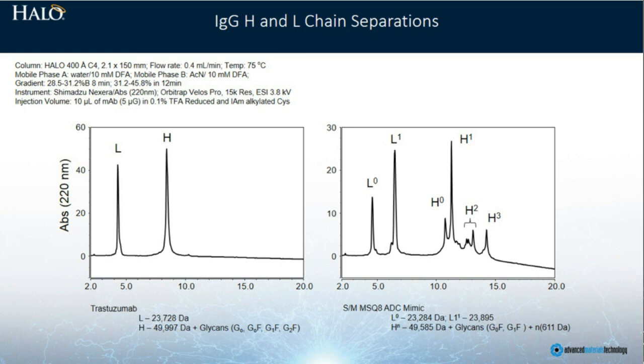Almost always in our lab, we use a combination of UV detection and online mass spectrometry. And we do this for protein analyses because we would like to be able to see the greatest dynamic range we can get, which UV detectors are very good at, but we also need information on specific identities, and the ability to deconvolute the complicated mass spectra to derive what we believe to be the protein structure. So that's, of course, how on the right-hand side we're able to distinguish the various antibody-drug conjugate identities for the light chain and heavy chain variants.